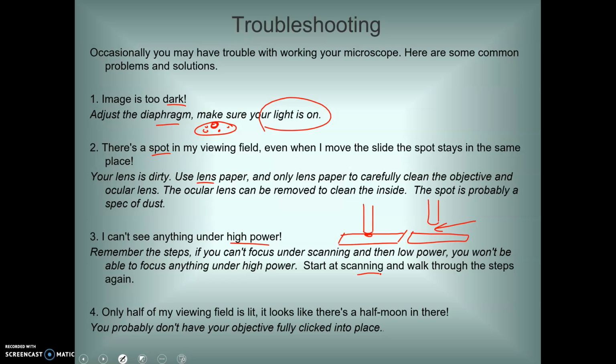Your slide might have moved. Your specimen might be off to the side, and high power is so specific, your specimen would have to be right in the middle. Call me over. I'll be glad to help you.